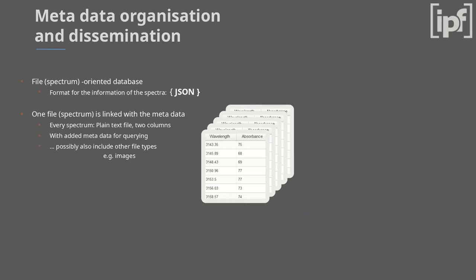So I wanted to have the spectral data clear and plain, readable for humans and machines alike. So I just decided a 2-column, so XY column data table stored in CSV files with very little descriptive information in the file name, that is, for example, the polymer type would be there and a few other metadata items, but not everything.